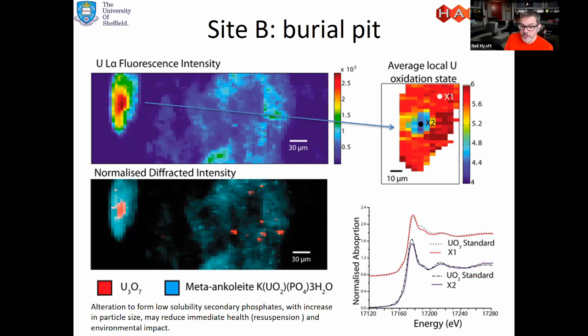So to sum this section up, high spatial resolution data on uranium speciation in complex environmental samples has been able to resolve the difference in site-specific behavior of depleted uranium particulates. The data is sensitive to particle variation of uranium speciation and able to resolve speciation gradients within the samples, particularly with respect to uranium oxidation state.